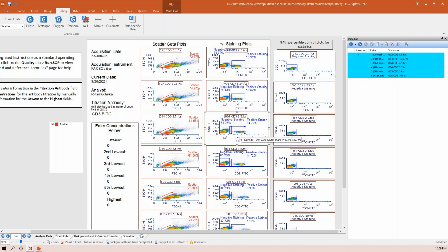One of the tools that we can use in FCS Express to make sure that we're gating the best way is data-specific gates. One way is to hold the shift key down when you're moving that gate and just slide it to the new location. You'll see on the gating tab that it has that gray background, so you know that it's active. Additionally, you can click it from the gating tab as well. I find the shift key a little easier when you're actually working in real time.